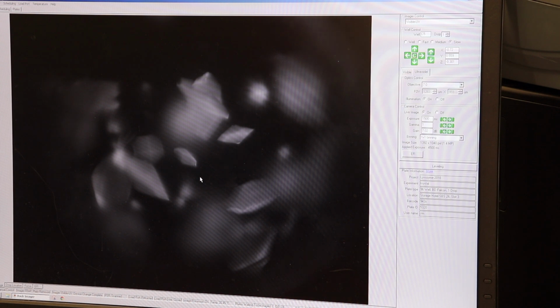Typically the UV is a diagnostic tool to help you determine if it's protein or salt. However, making a nice picture to show your PI or grant or whatever can't hurt. So then we'd save that one too. And then you'll have a picture of, basically the same day, of UV and visible at the same zoom that you can compare with.